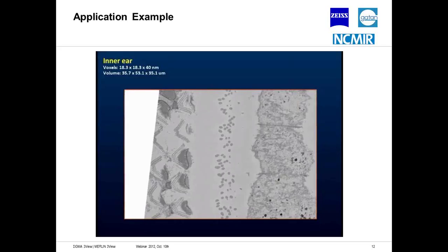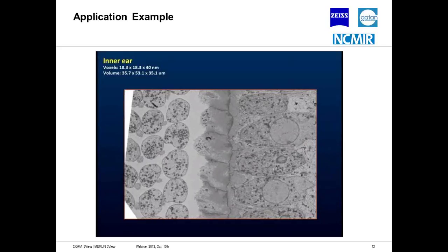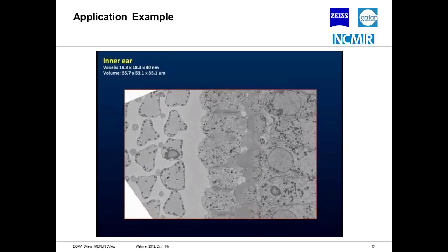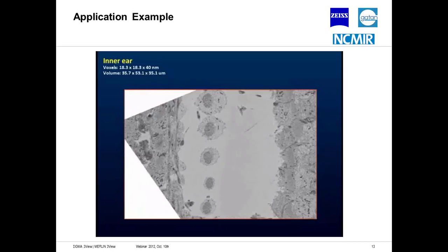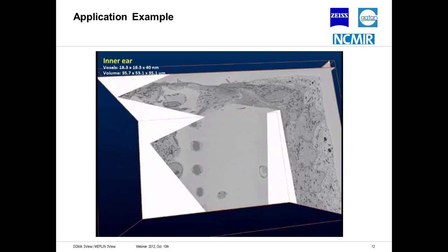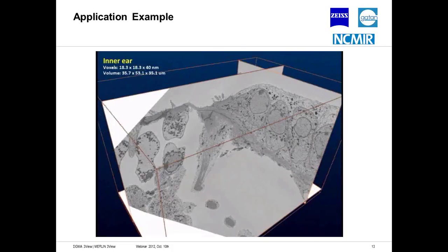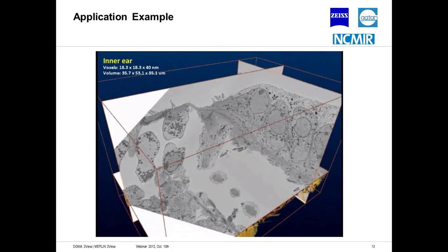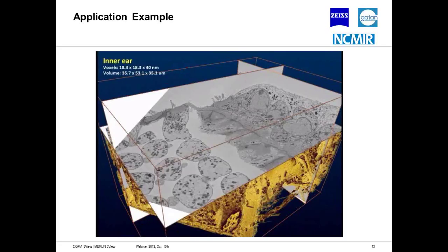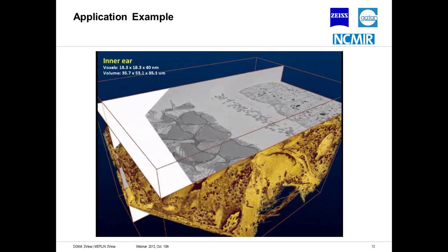I use this movie as a story to elucidate this idea. This was a movie taken by a group at the University of Helsinki, and they hired a software engineer to create automated segmentation algorithms, which you'll see shortly. Some of the cells will pop up in different colors, and that was done automatically. You didn't have to go and trace the cells.